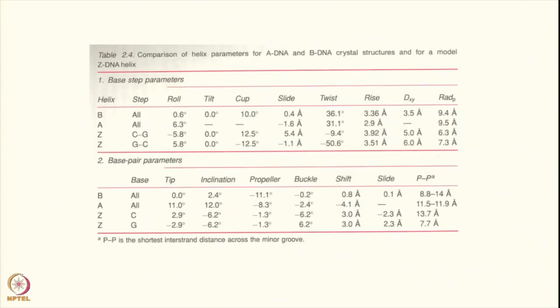And this is the continuation of the same. So what sort of parameters are there for the orientations of the base pairs, and this is for the Z DNA, and those were for the A, B, C and D, etc. Since in the Z DNA you have different things for the 2 different steps, the CG steps are different, therefore you have different parameters here for the 2 things.